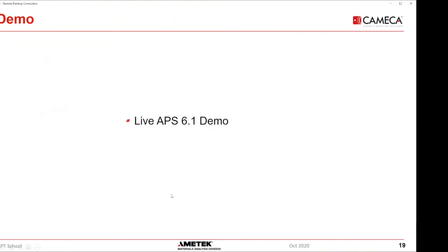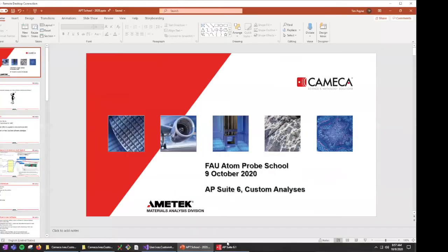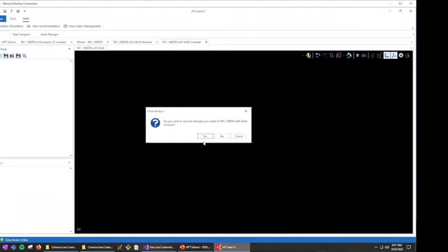All right, so I want to go back to the APSuite demo and show you some of the things that I'm really excited about in APSuite. And unfortunately, I apologize, the demo of the Saxi plot didn't work.